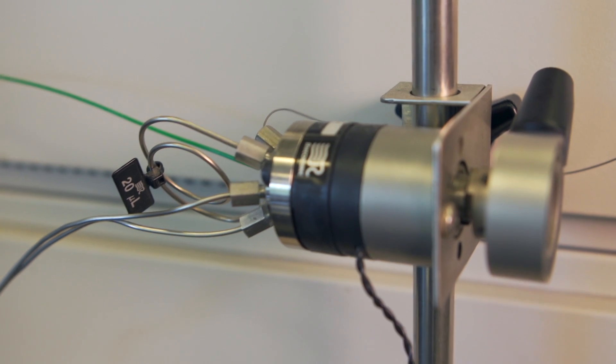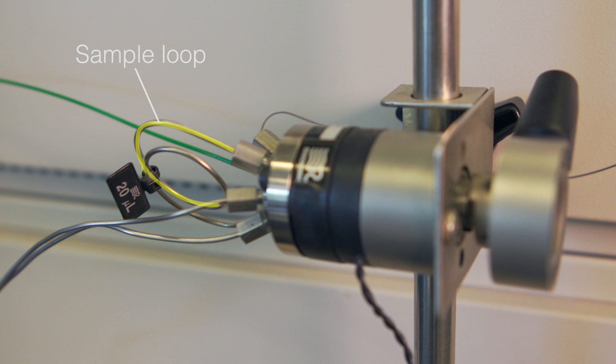The injected sample fills a length of tubing called the sample loop, which has a fixed volume based on the length and diameter of the tube.